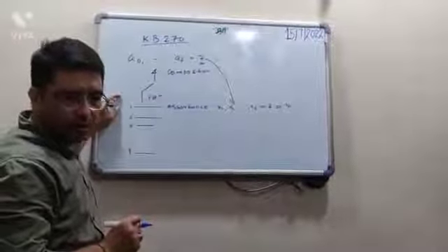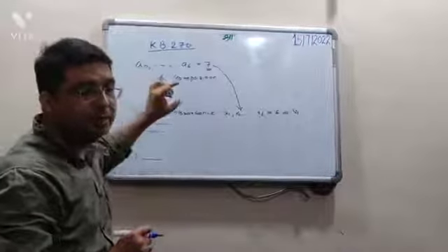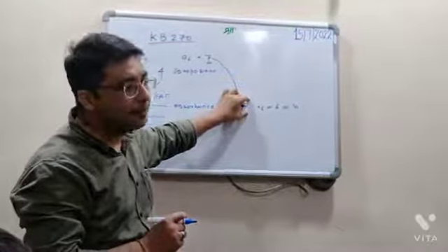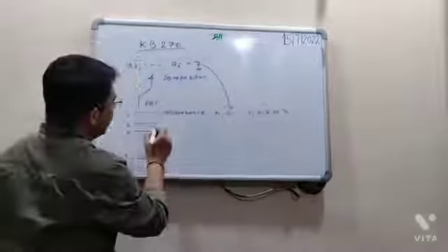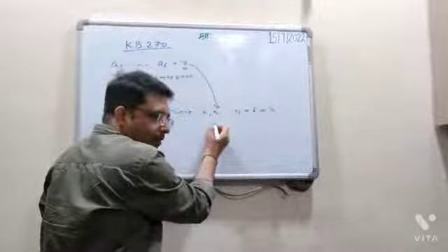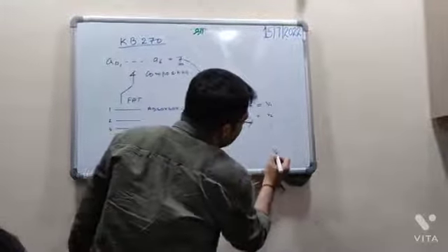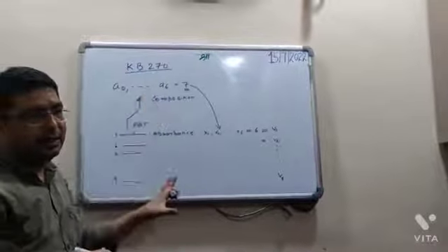Value 1 means the value of fat for this sample, which is calculated by the instrument using this absorbance band, and that value is V1. Similarly, it will calculate for sample 2 using another absorbance value, and that value I'll call V2. Similarly, it will calculate up to V9.